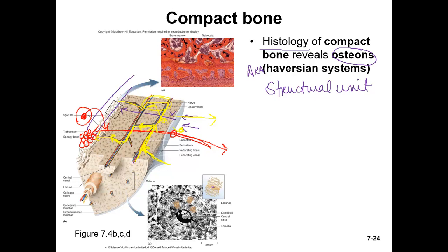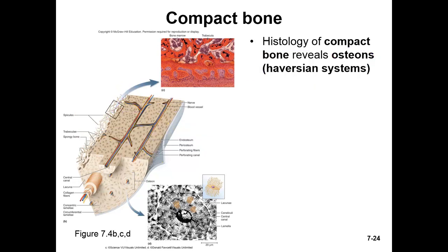So when you see all of that, from our original picture here, what we're talking about when we're dealing with the osteon or the Haversian system is, in the histology of the tissue, this entire system that's got several different major players. And this is what you were used to seeing when we were looking at histology and bone tissue, and we would say, oh yeah, they look like tree trunks, that's bone tissue, okay, now we're done.